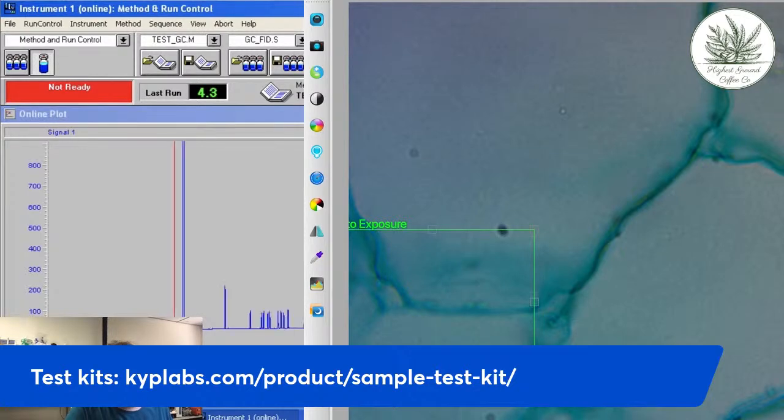All right, so this is our injections that are running. This, again, is the calibration standards. So this is the first good injection. The next one should also be good. But for whatever reason, the very first injection after the machine hasn't been running tends to not inject as we would like it to. All right, so let's go straight to the 20.